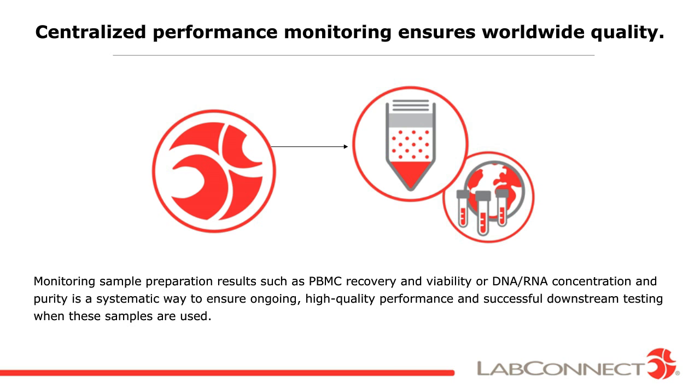So just to wrap up this section, we have touched on the importance of quality systems and capacity, the importance of having a robust analyst qualification program in place, and then also the importance of continuous performance monitoring. Now we're going to move into our final key to success.